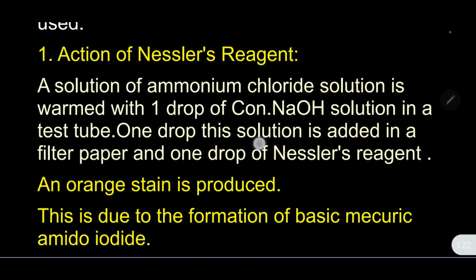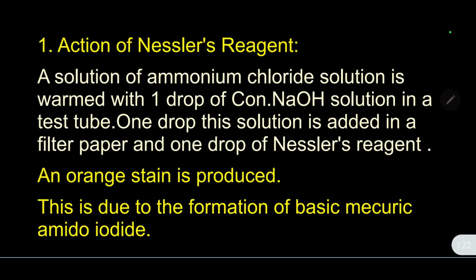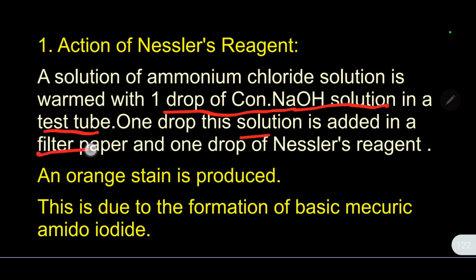The next test is the action of Nessler's reagent. A solution of ammonium chloride is warmed with one drop of concentrated sodium hydroxide solution in a test tube. One drop of this solution is added to a filter paper, and one drop of Nessler's reagent is added.